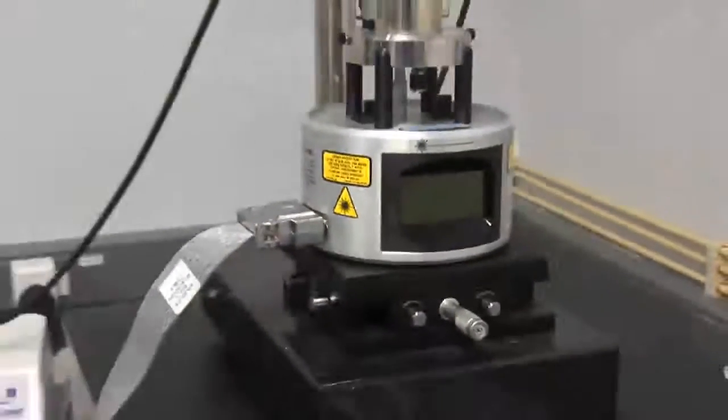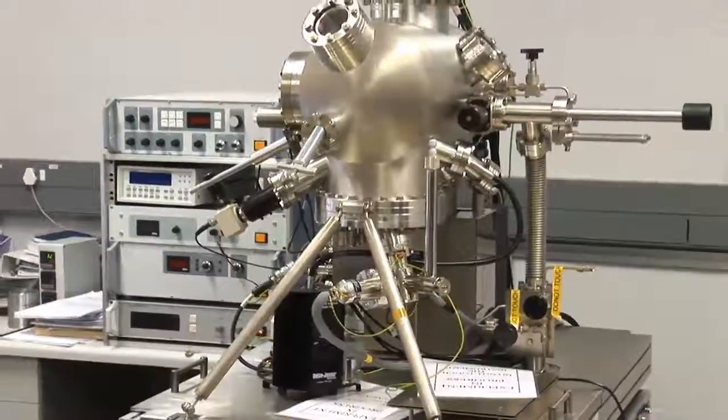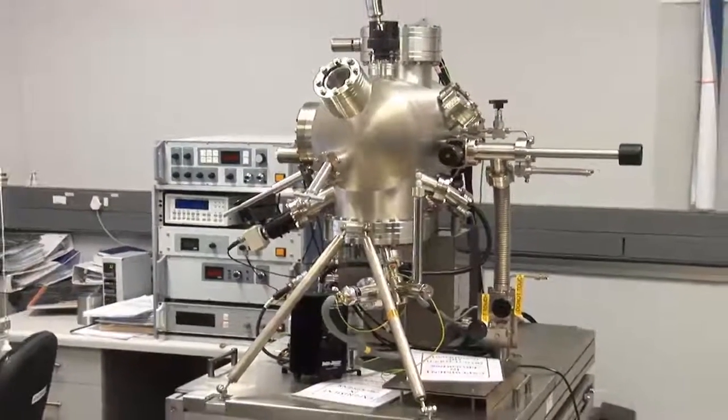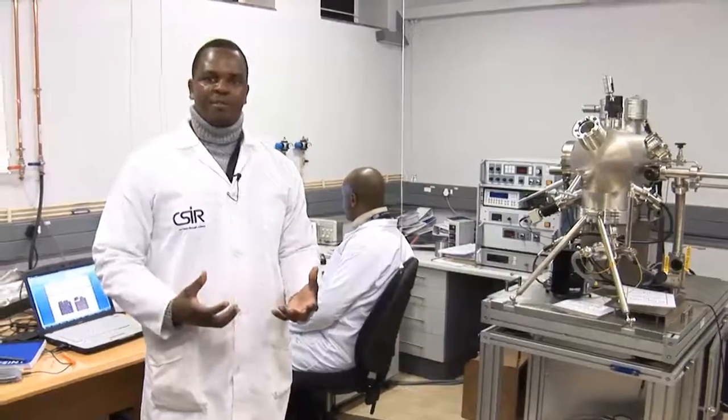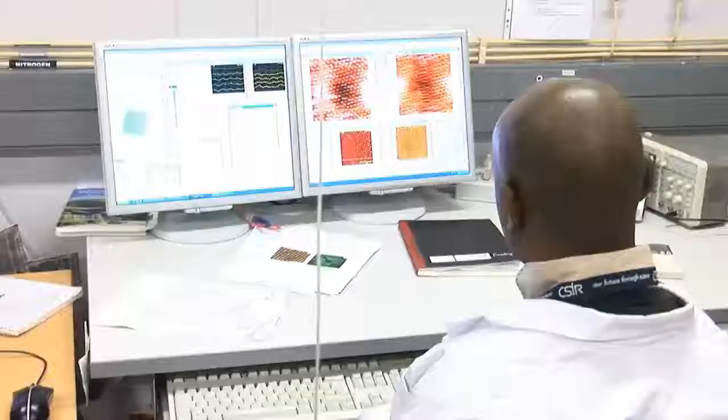The existence of nanotechnology remained postulation since the introduction, and that was because we didn't have facilities that were good enough for us to visualize what nano would be. A few years ago, the discovery of what is known as the atomic force microscope and of course the scanning tunneling microscope have allowed us to zoom in and be able to see the arrangement of atoms, but also to manipulate them. This is the basis of what nanotechnology is and is known to be today.